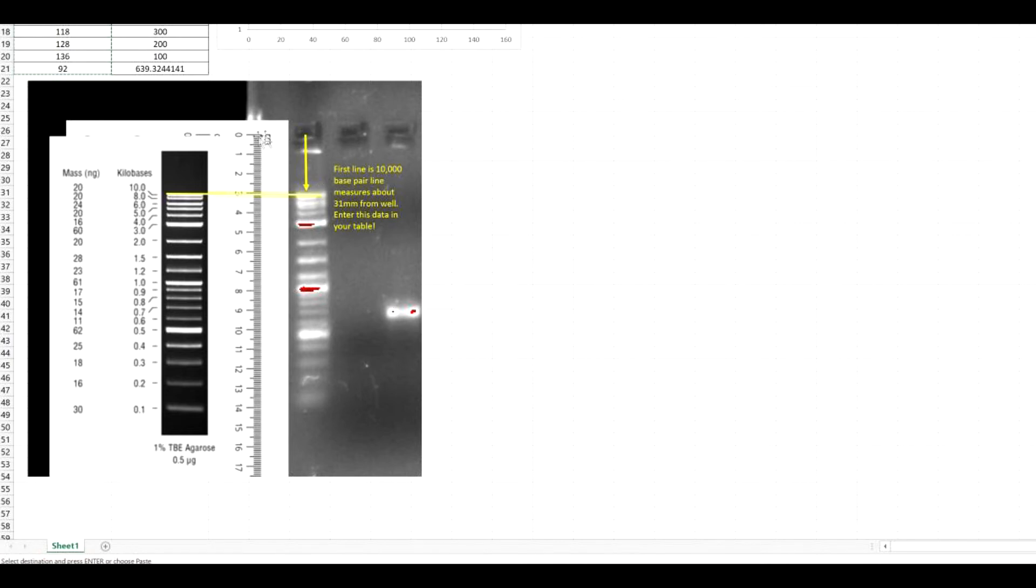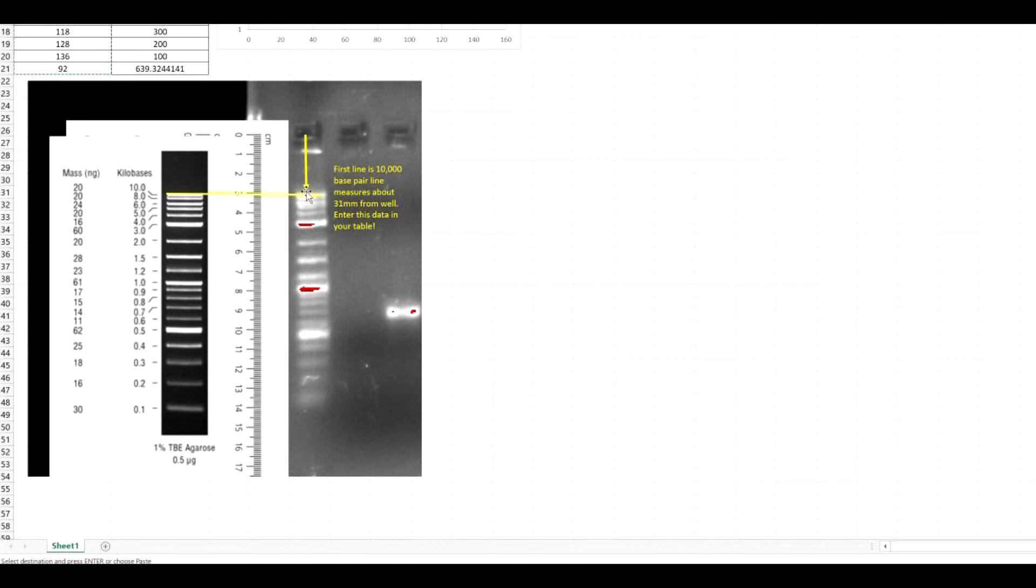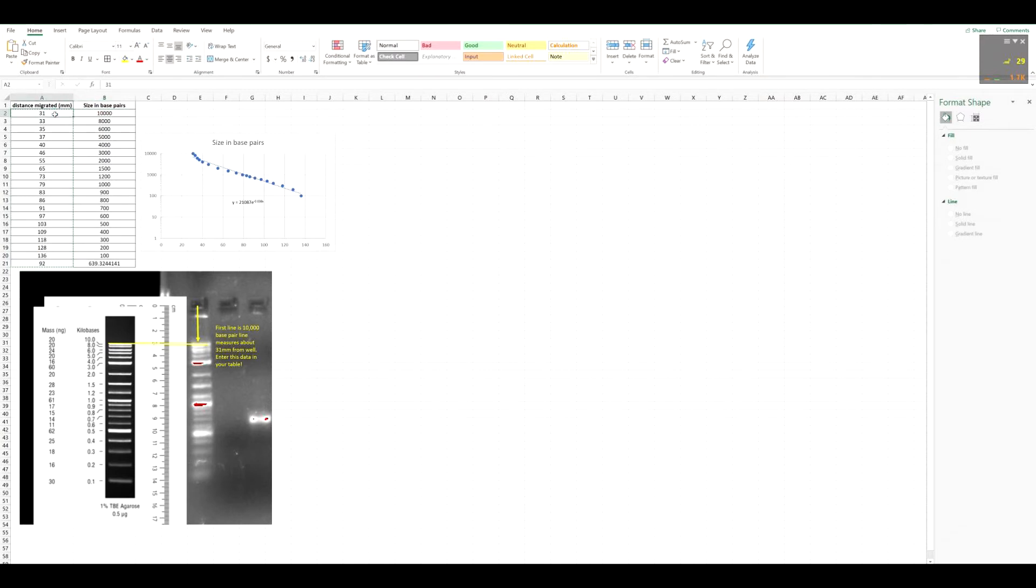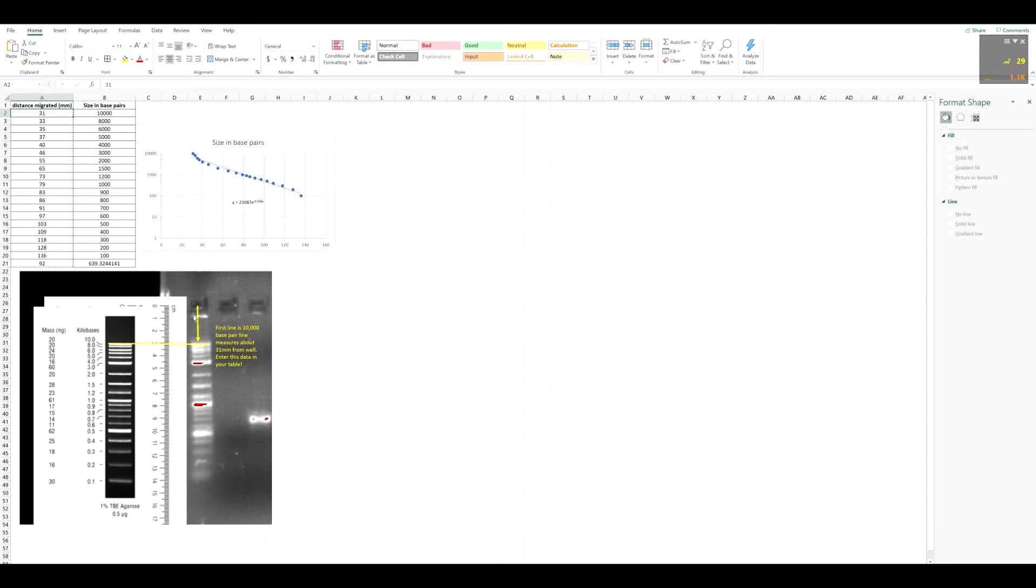So you would take your ruler, put the 0 next to this, in the middle of this blank spot here, which is where you load your sample. And then you would just measure in millimeters the distance to this first band. If you can't discern the band, measure it from the thickest part of it. So this one here noted in this yellow line would be about 31 millimeters. So what you would do is at this 10,000 base pair up here in this data table, you would just write 31. And then you'd measure every individual band from there. So this next to the 800, then the 600, 500. Whatever bands you can discern, you want to measure from the well to that point.